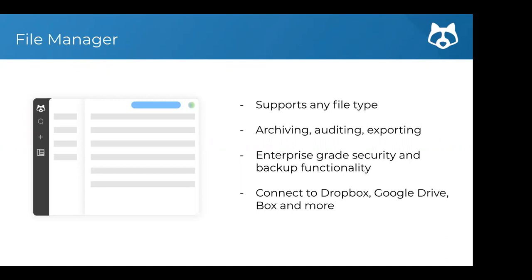You can also connect your file manager to Dropbox, Google Drive, Box, and OneDrive. So if you want to back up everything — which is always a good idea — you can very easily, with just a couple of clicks, back up all your data into a different storage provider.